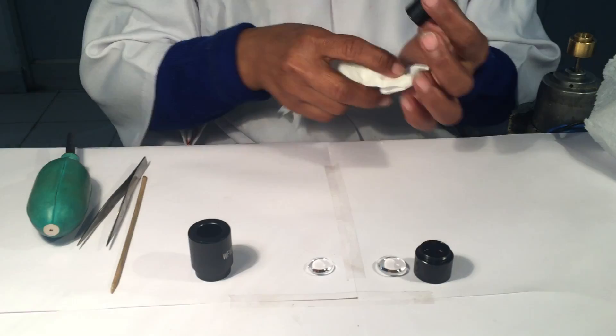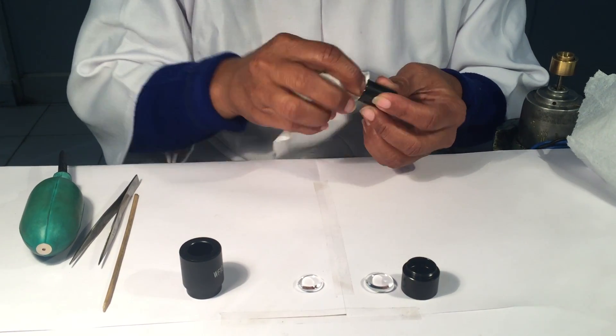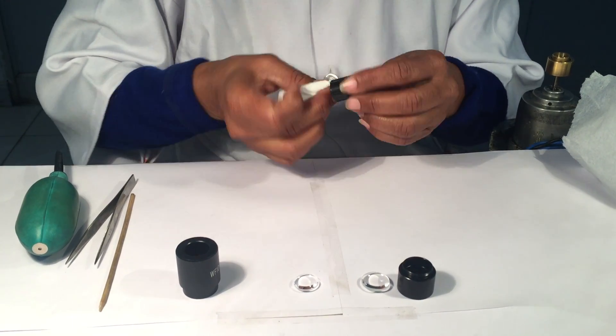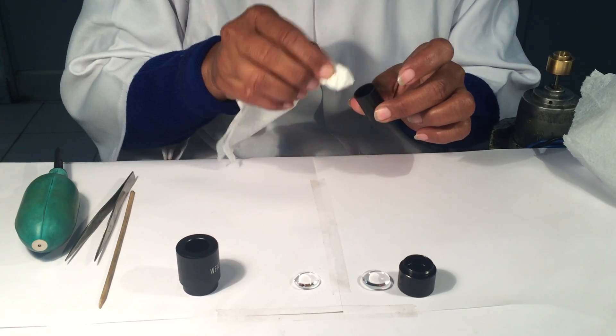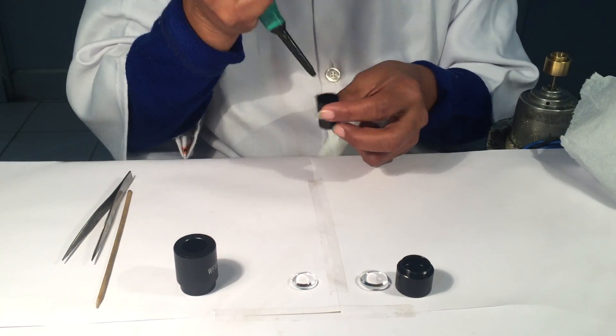We will take the spacer, we will do the same process of cleaning it inside with a cotton tissue paper and then air blow the same.